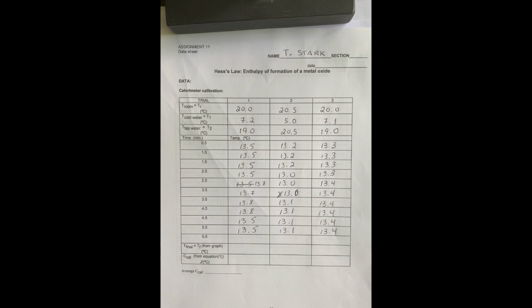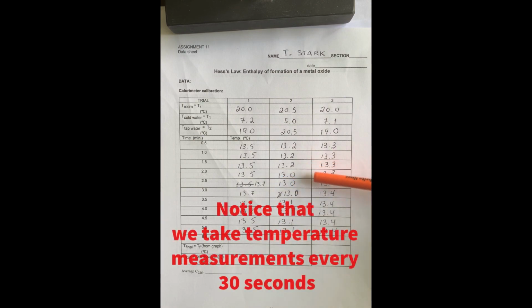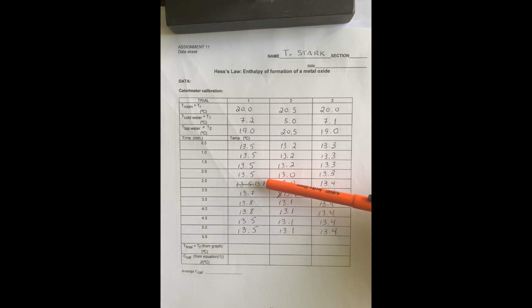Anyway, this is a sample data set. Notice that you are going to be given 3 trials worth of data. And for each one of those, you have the room temperature, the temperature of the cold water, the temperature of the tap or warm water, and then the measurements here. Don't forget that, kind of like Tony did here, if you make a mistake, don't blot it out. Just simply cross it out with a single line and then put in the correct number. Now, I'm going to transfer all of this data into an Excel spreadsheet, and we're going to work off of that.